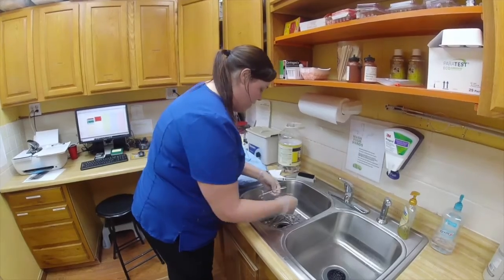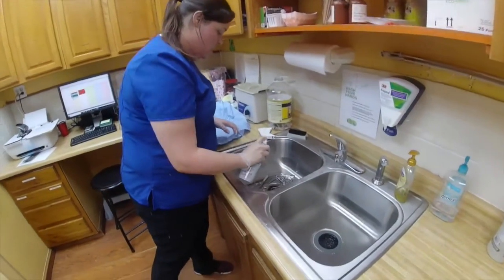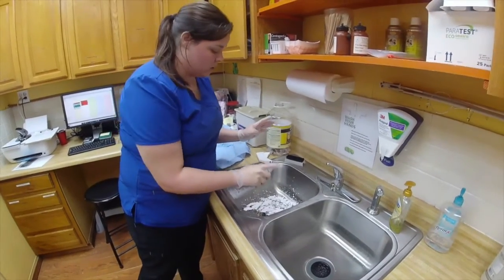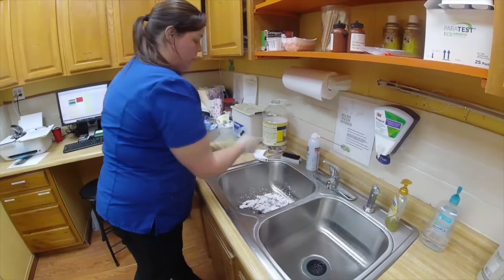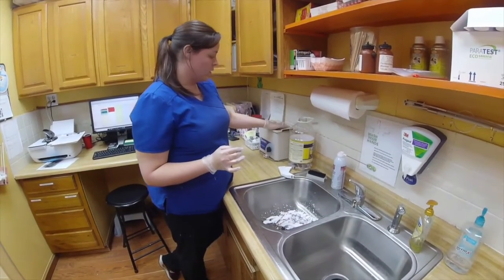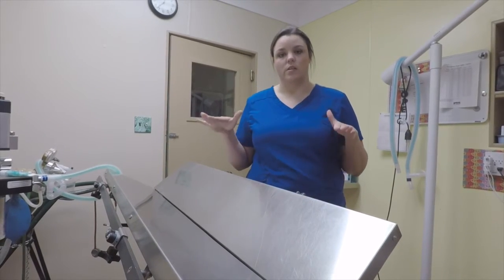And then we have an antibacterial foaming spray that we spray on them. We just want to spray it on there really well. Let it sit for about 5 to 10 minutes, and then you scrub it in hot water with our cleaning brush here. And then all of our instruments go into a shaker for 20 minutes, and then they are ready to be autoclaved.